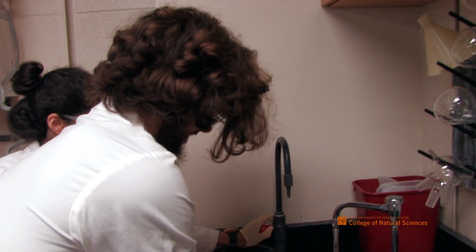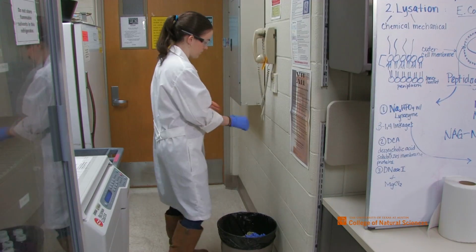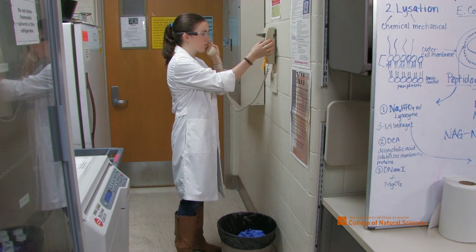If any incident involving a biological exposure or spill occurs, notify your instructor or TA immediately so that they can notify EHS.